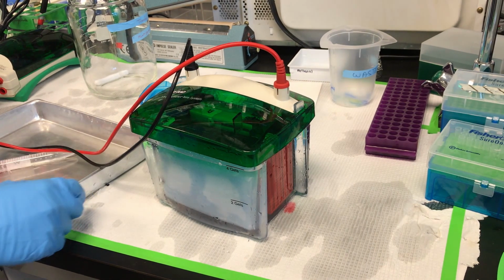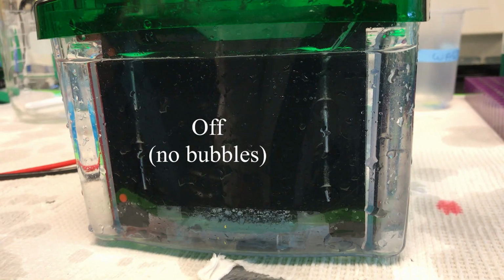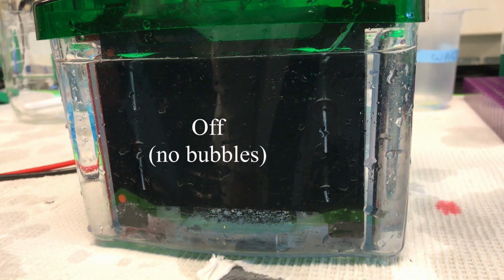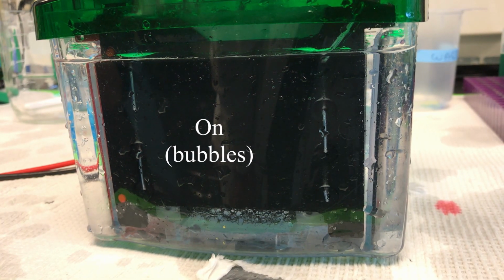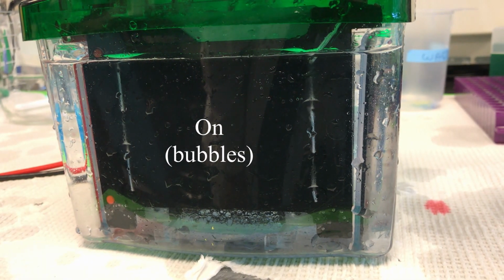Connect to the power supply and run for 1 hour at 100 volts. And then turn it on. You should be able to see the bubbles, and that's how you know it's really working. Good.